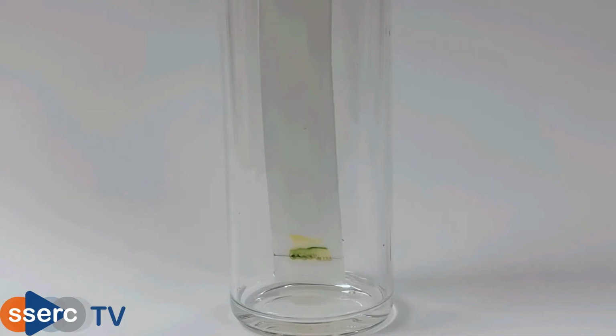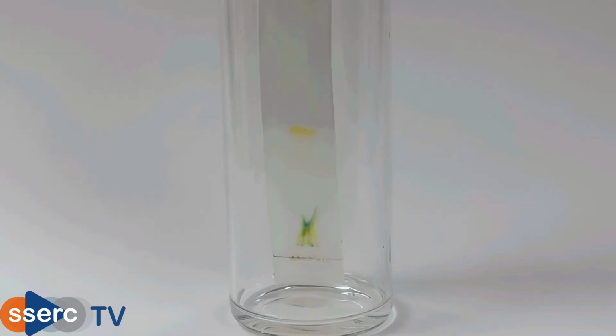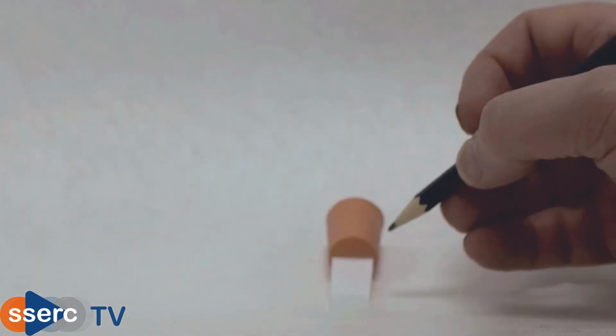In this speeded up version, you can see the solvent moving up the plate and the different colours separating out. Once the solvent has reached near the top of the plate, remove it from the container and immediately mark the position of the solvent with a pencil.